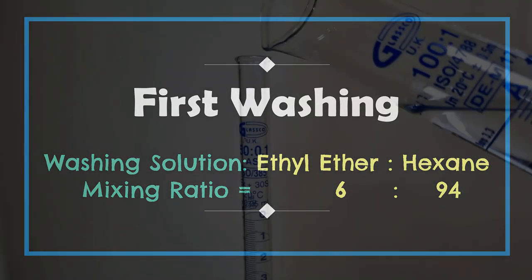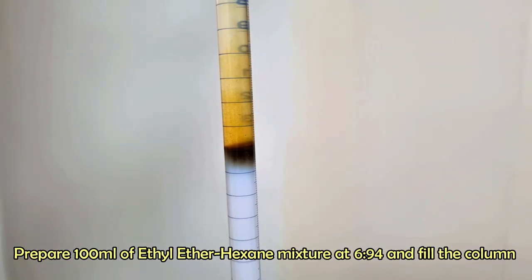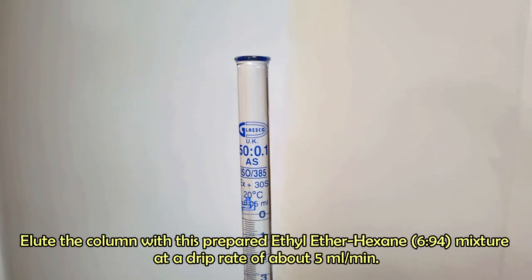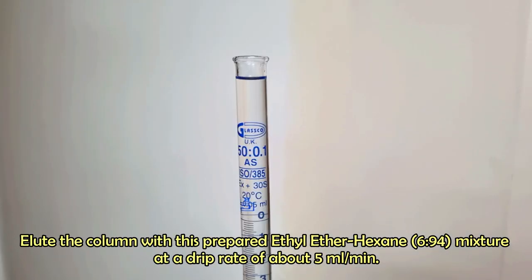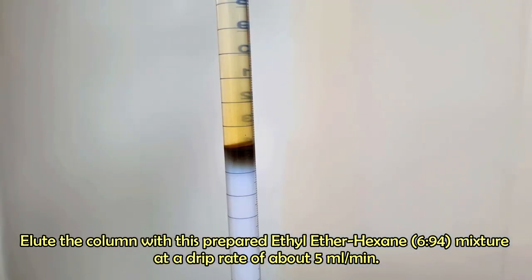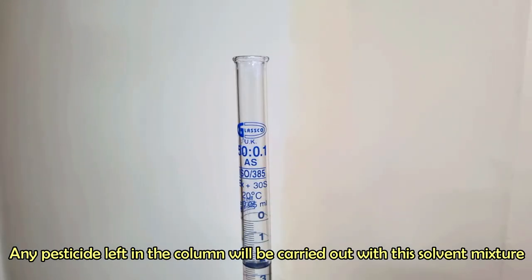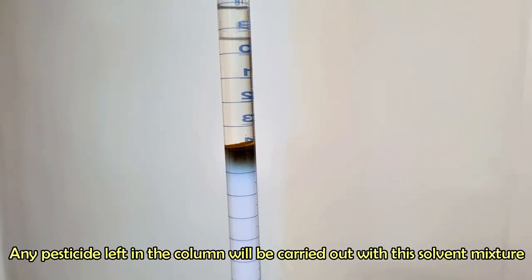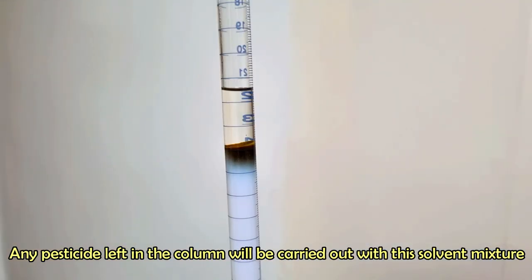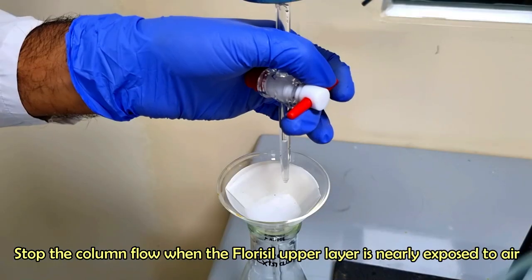Now, prepare 100 ml of ethyl ether and hexane, 6:94 mixture. Elute the column with this ether to hexane mixture using a drip rate of about 5 ml per minute. Collect the eluate in the same collection flask in the same way as the extract collection. Stop the column flow when the florisil upper layer is nearly exposed to air.